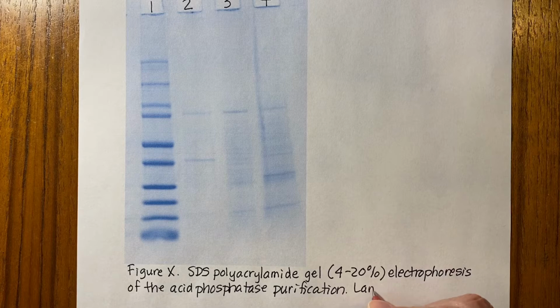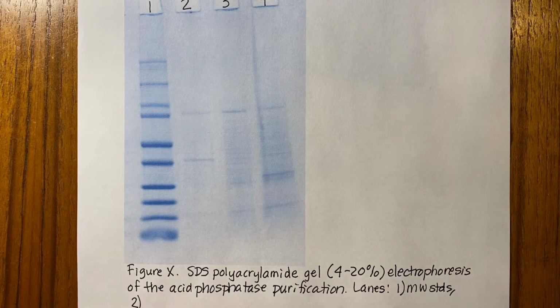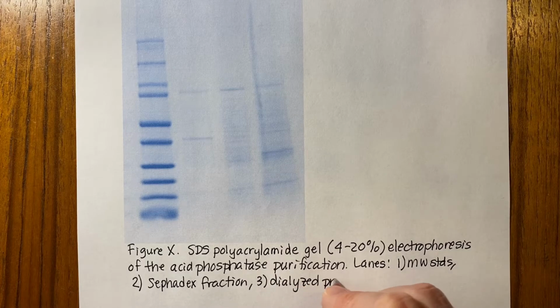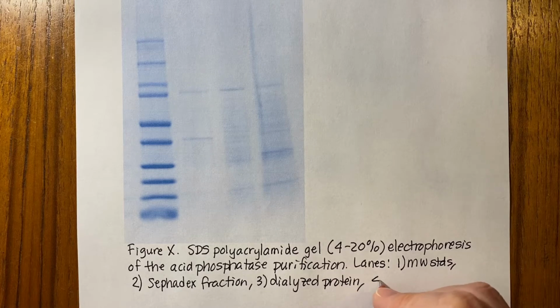So just say something like lanes: 1 is molecular weight standards, 2, maybe just put a parenthesis, 2 is sephadex fraction, 3 would be the dialyzed protein, and then 4 is the crude extract.